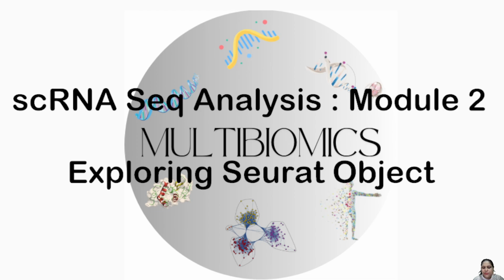What happens is that many layers of information, like important markers associated with it and the top 10 variable genes, are not stored because they are not part of the Seurat object. In that case, you can list all these objects and save them separately, and then load them as you need them. But for the sake of this demonstration, I have saved the whole image file of the entire workspace with the help of the save.image function. This will help me to load the entire environment without losing any data.